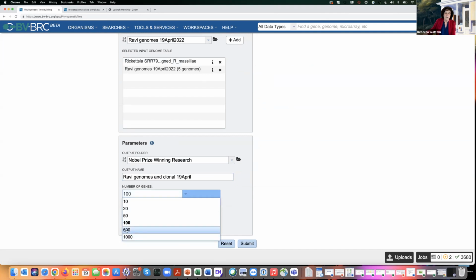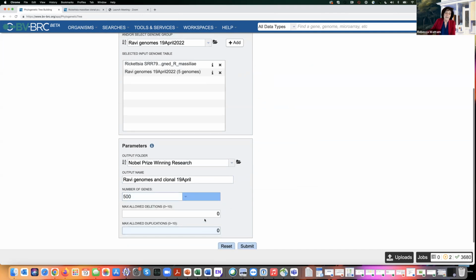Now let me describe what this service does. This is our Codon Trees pipeline, and it takes perfect protein families from any genome that's annotated, all the public genomes and your private genomes. When they run through the annotation service, they're all annotated using the RASTtk pipeline, and part of this is assigning protein families.